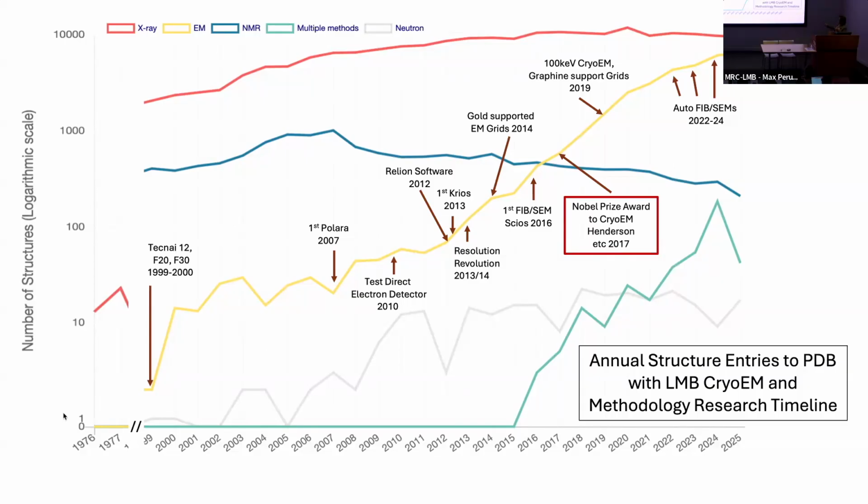and the graphene then continued to develop, like HexAuFoil. They became the gold standard of the most stable support in the research world, and also the expanding of the 100 kV EM, and the detector becoming better and better.